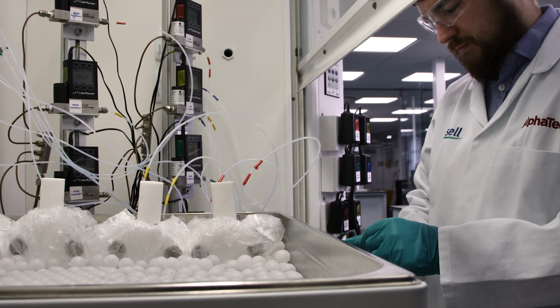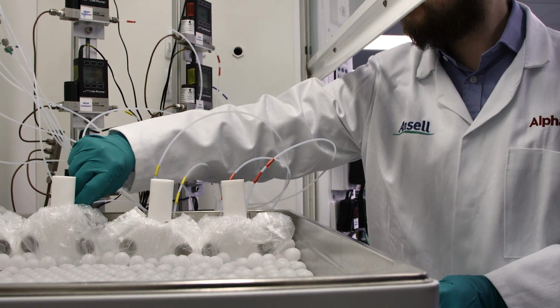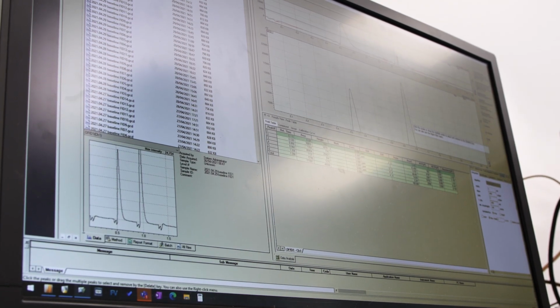There are a number of permeation standards that can be adhered to when performing a standard permeation test. Although they largely run off the same principle, and you can show data for all of these in one permeation test, there are some differences in how the data is calculated and what information is shown in the final report. We're going to go into detail now about some of the ways this information is shown, and the two major ways are in standard breakthrough times and in cumulative permeation.